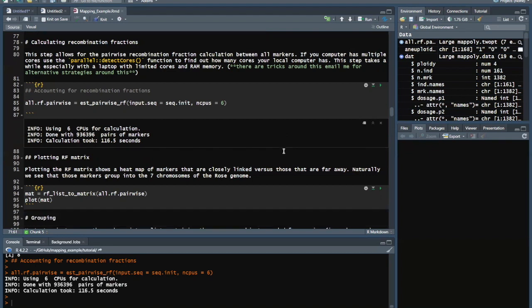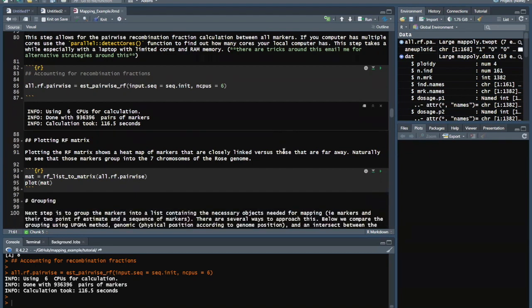Yes, I agree, and I'm thinking Sanjay will mention whether in the progeny that is a genotype error or a real recombination. If I understand him correctly, no. Thanks, my question is answered. I was just saying that we only take those markers which are validated in the parents, and only take those markers forward for mapping. That question is answered.